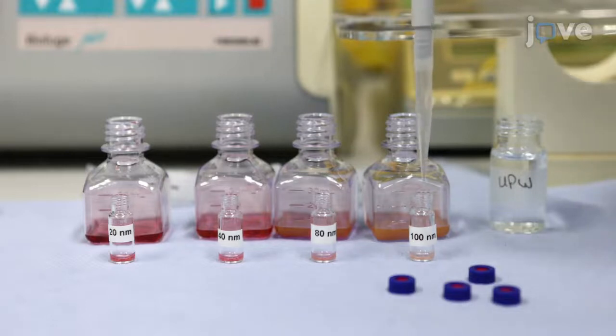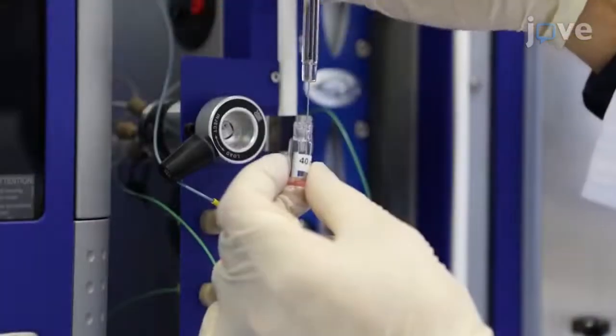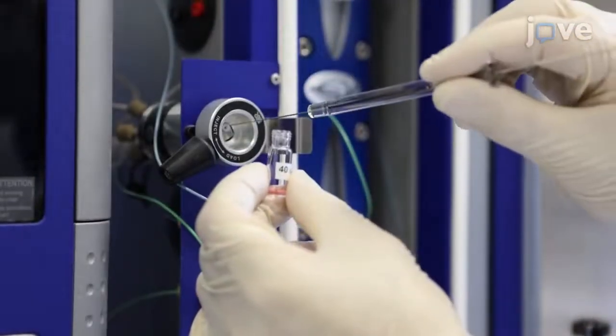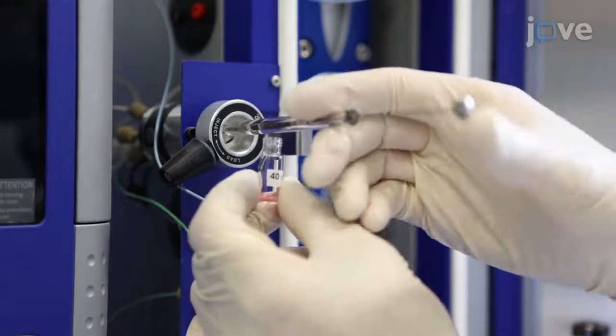The beauty of AF4 is its very broad application range, which covers not only nanoparticles of different natures and sizes, but also includes proteins, viruses, and synthetic or natural macromolecules.